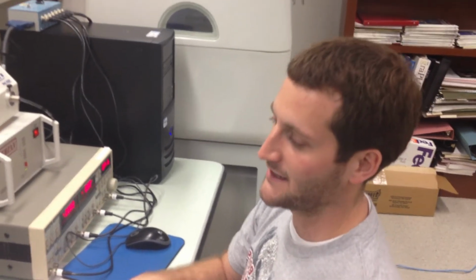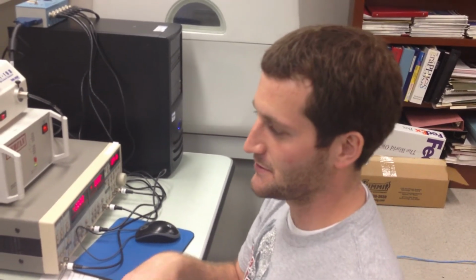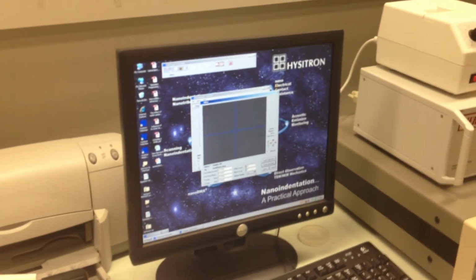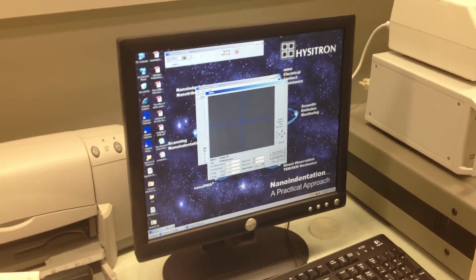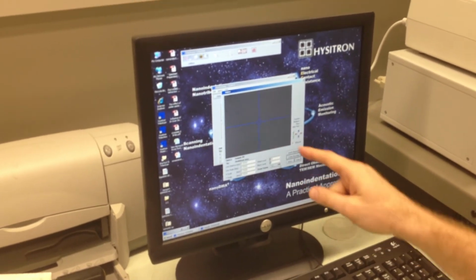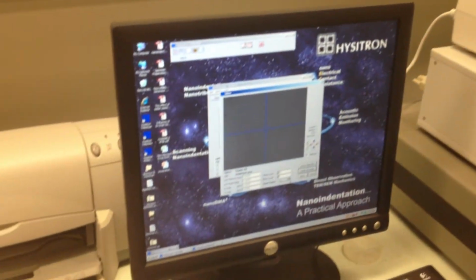that way. And like I said, there's a lot of good safety protocols built into the software that don't let you do that. So if you start to sense an excessive force, it's going to stop the whole shebang, and it's going to make you start over. So you want to have that zoom factor on the same zoom factor that you had when you calibrated the optics.